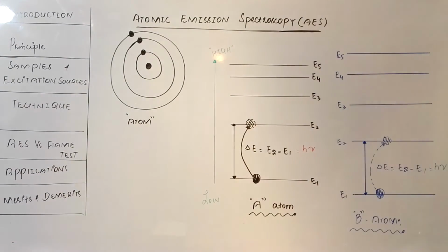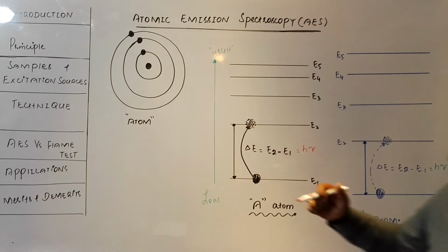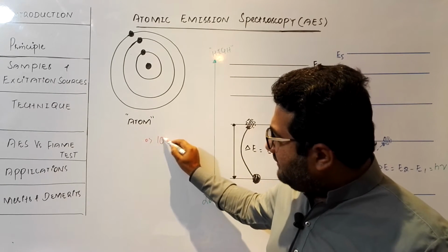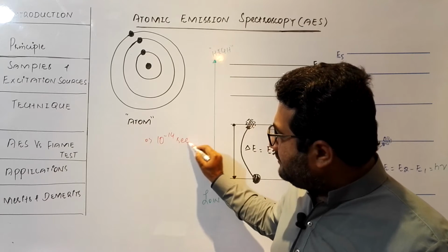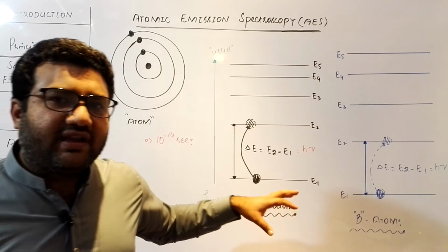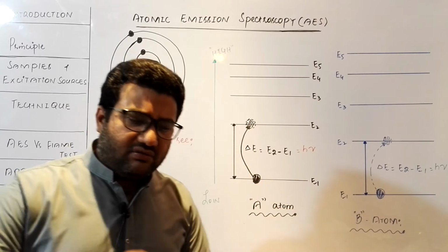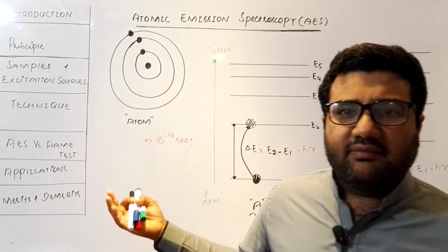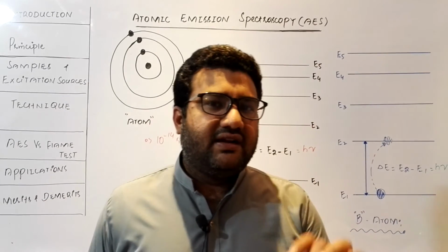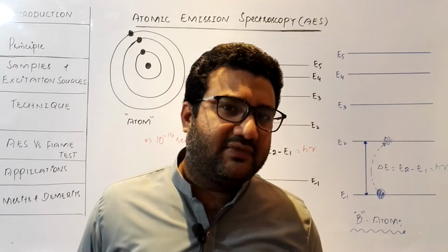But you know, every electron, when it moves from a low energy level to a higher energy level, becomes unstable. And in the higher energy level, it can spend a maximum of 10 raised to power minus 14 seconds. In some books, it is written that an electron can spend a maximum of 10 raised to power minus 8 seconds in the higher energy level. So, keeping both in mind, 10 raised to power minus 8 or 10 raised to power minus 14 seconds, it is quite evident that whenever an electron moves to a higher energy level, it spends a very short duration of time there.